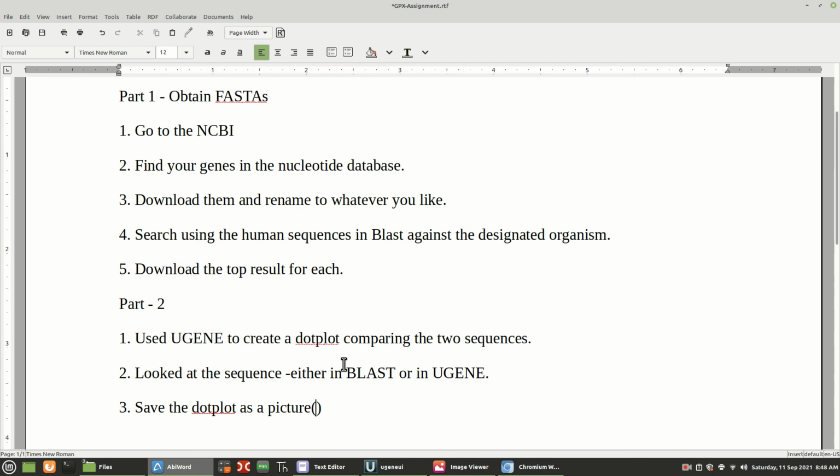I'll say JPEG, PNG, or bitmap. All right, and you save that. You will add that to your analysis.